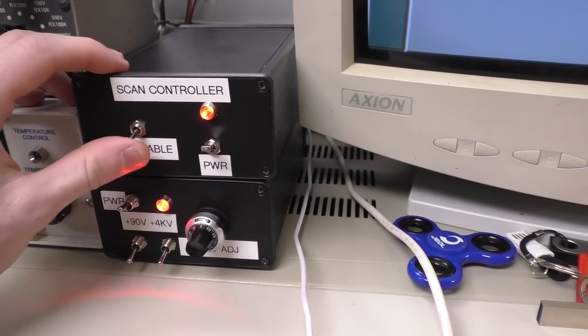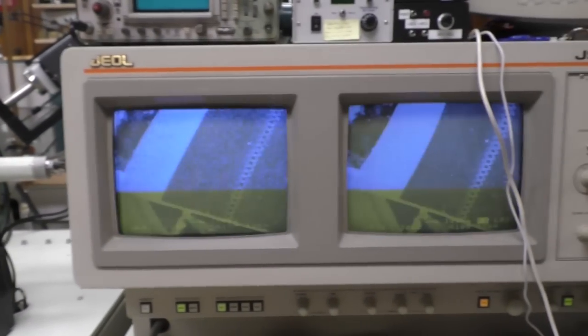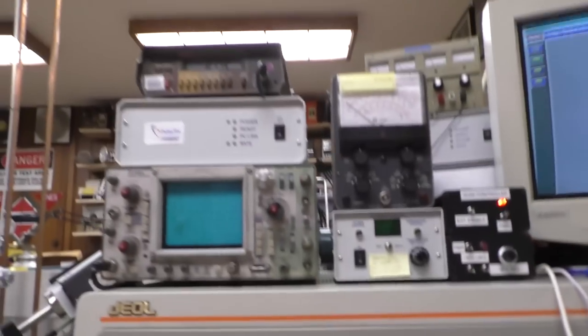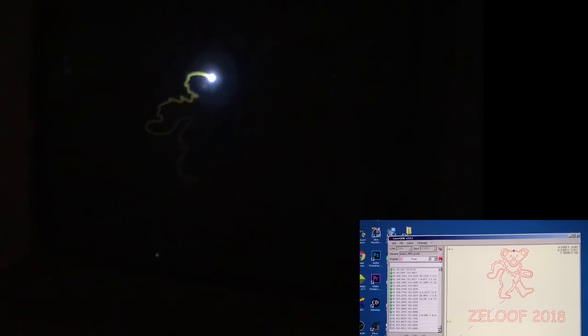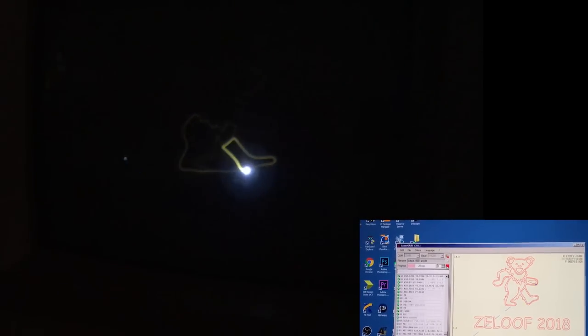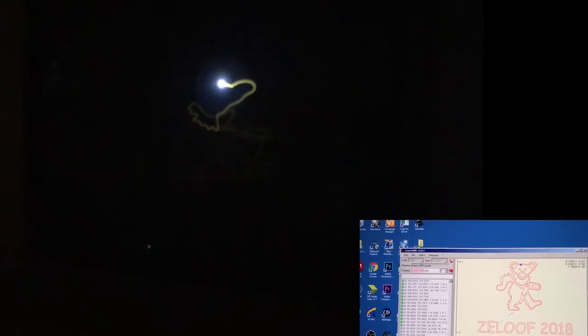Turn on the electronics, start with the scan controller, and then the high voltage power supply box. After that we'll obtain an image normally with the microscope, and then we have to adjust the probe current — you have to do some experiments getting this matched to get the exposure right. So I'll adjust that to get the right emission current that I want, about 0.03 microamps. Then we'll enable the external scan control, turn the lights off for added dramatic effect, and then we can start making things. Right now the images are exported from Inkscape, converted to G-code, and sent over to the Arduino via GRBL, where they're buffered and sent to the CPLD. Eventually the CPLD or FPGA will have USB directly, you'll be able to send over the whole program, it'll be buffered in memory, and sent over at very high bandwidth to the microscope. But that's version 2.